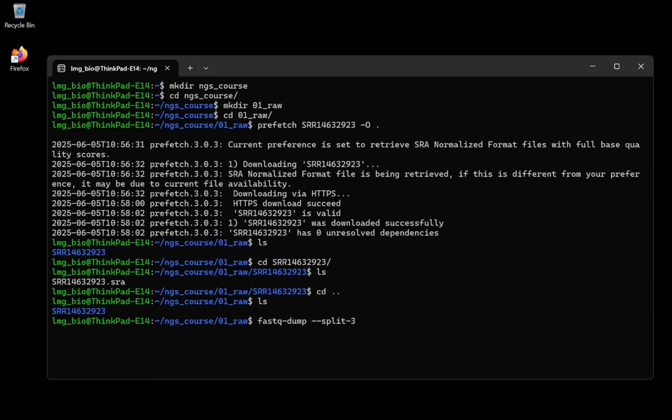The SRR is in the SRR folder, so this one, and we want the SRR something dot sra. We press enter and we wait.